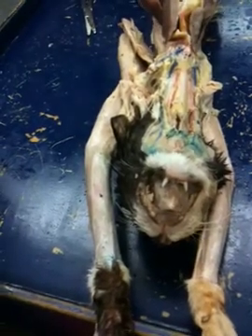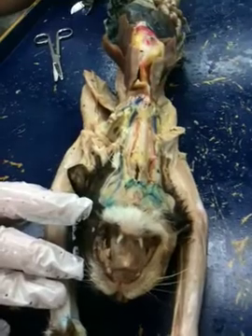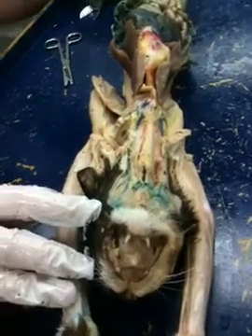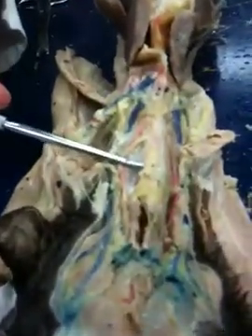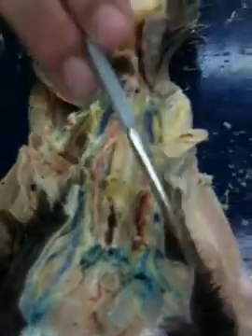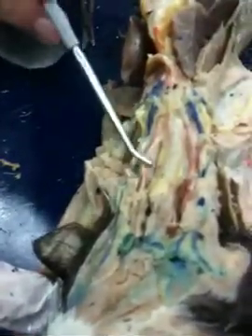Okay. So that one's going to be in. I told you about that, that's the larynx, opening of the esophagus. The esophagus, you look under here, see that tube that's sitting right underneath the trachea? That's your esophagus. Parotid salivary glands are under here. Your submandibular is going to be down right about here. You may have to clean out a little bit.